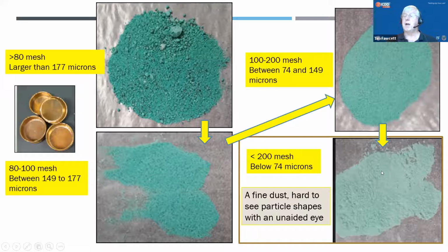And that's because your eyeball is a pretty good detector. Most people's eye can see particle and particle differentiation at about 25 to 50 microns. And that's the magical area where we want to grind our powders down. And so if you see particles with your eye, you're probably too large. And so you don't need a fancy instrument, you just need to have a critical eye.